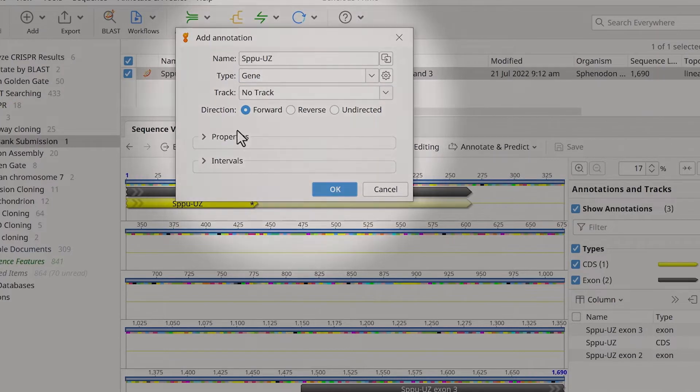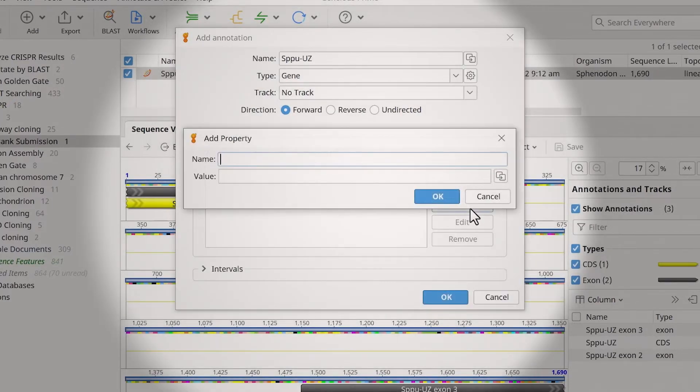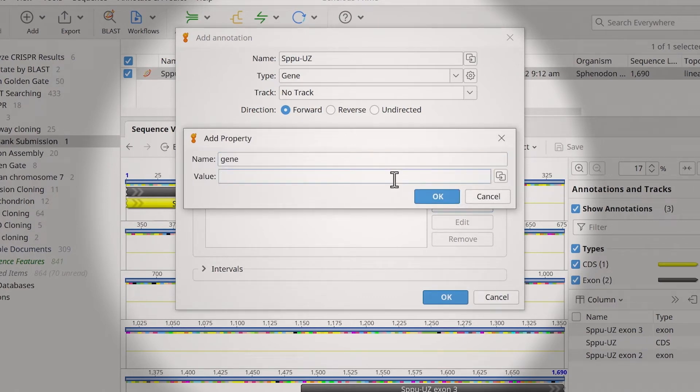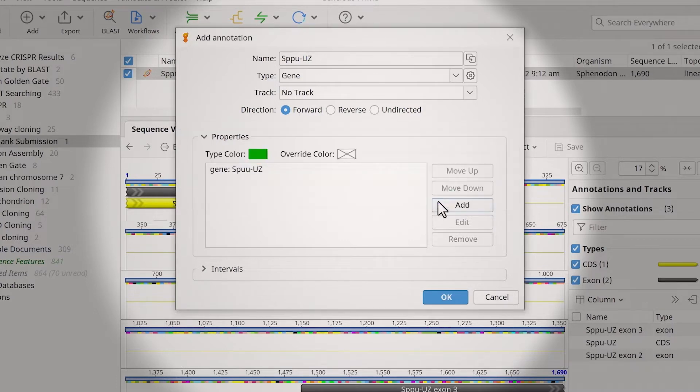Gene annotations also require a gene qualifier. To do this, expand the properties options and click Add. For the name, enter Gene with a lowercase g. Qualifier names are case-specific. If not typed correctly, they will generate errors during submission. For the value, add the gene name and click OK.